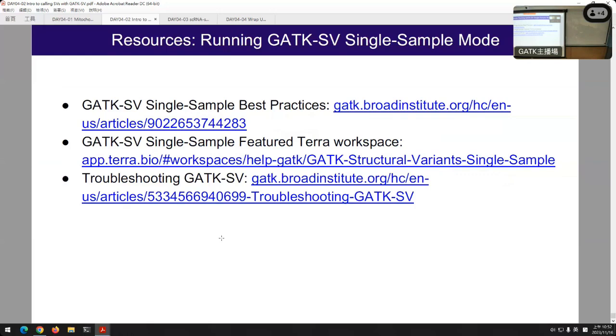Following the previous gentleman's question, can GATK-SV detect functional translocations such as fusions that can be implicated clinically? And if it is not the best solution, what are other recommended algorithms or tools that we can apply to this DNA-based sequencing method? Thank you. Yeah, so GATK-SV should be able to detect the translocation itself. SV annotate does not currently annotate gene fusions as one of its predicted functional consequences, but that's something we're really interested in trying to add in the future. I don't know when that would be, though.